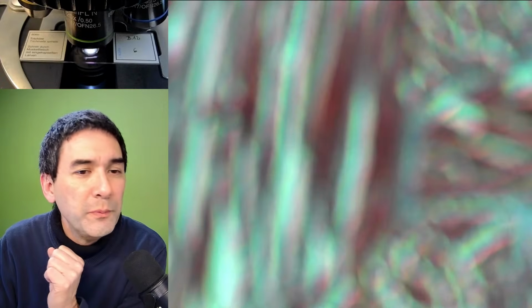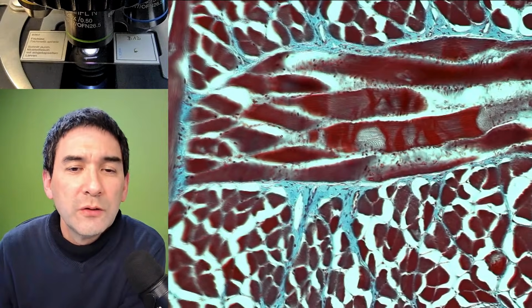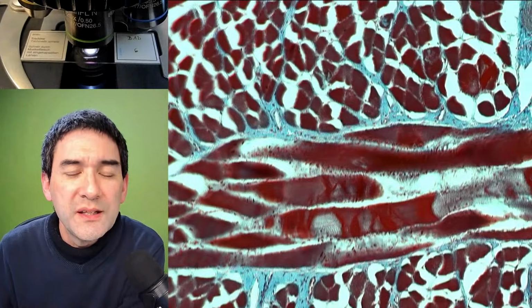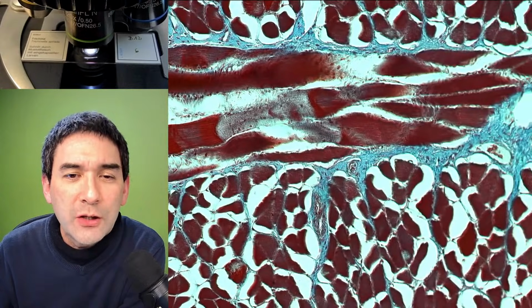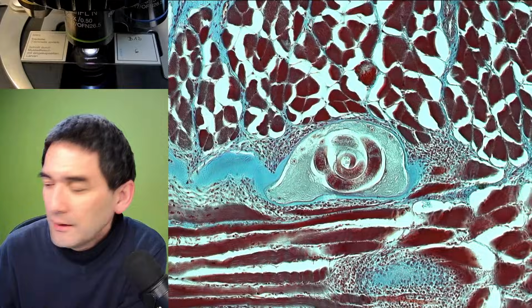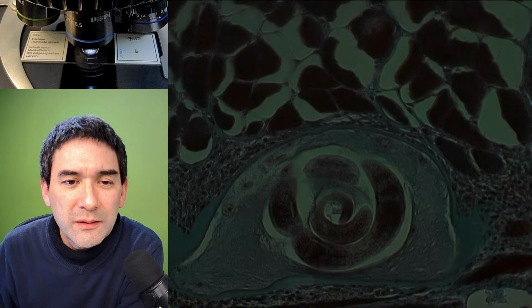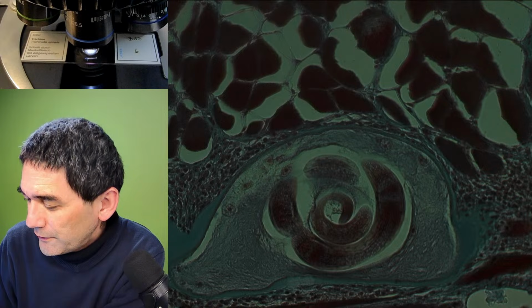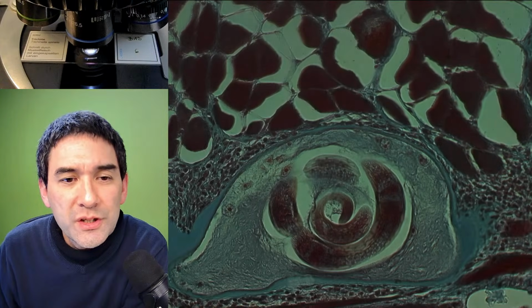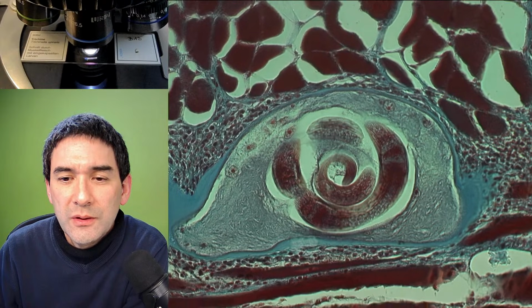So the scope view, and I need to get the whole thing in focus again. Okay, and that's muscle tissue, and we're now going to look for several of these nematode worms which are actually encapsulated in there, and here is already one of them. Okay, and eating this meat is a little bit... I'm going to turn off the automatic light adjustment here. So here we go.